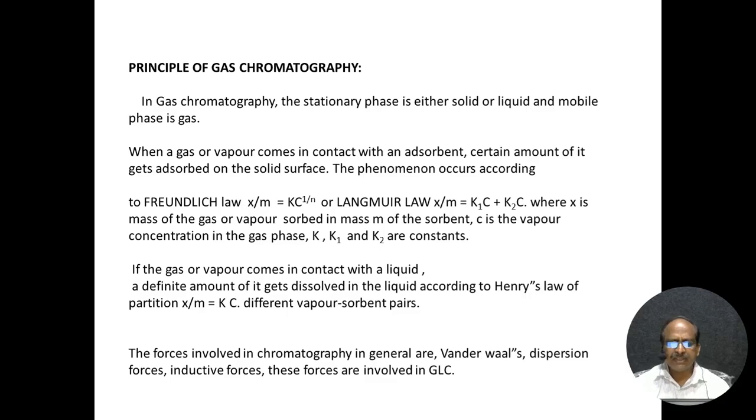These are the two phases. Every chromatography has two phases: one is the stationary phase, the other is the mobile phase. In gas chromatography, the mobile phase is the gas, and the stationary phase is either solid or liquid.